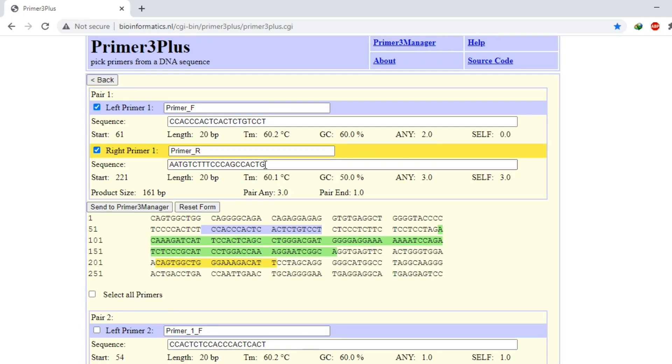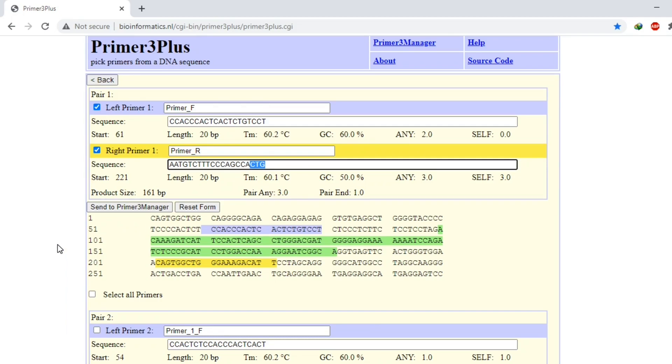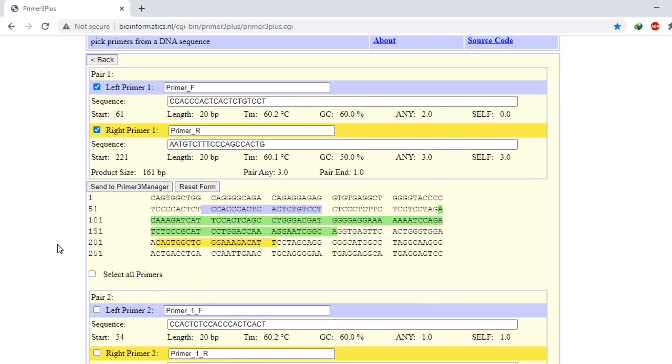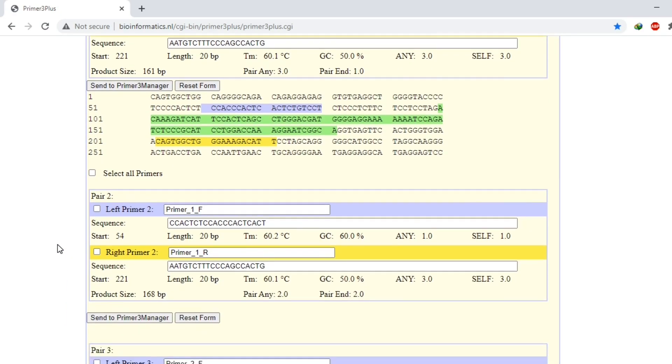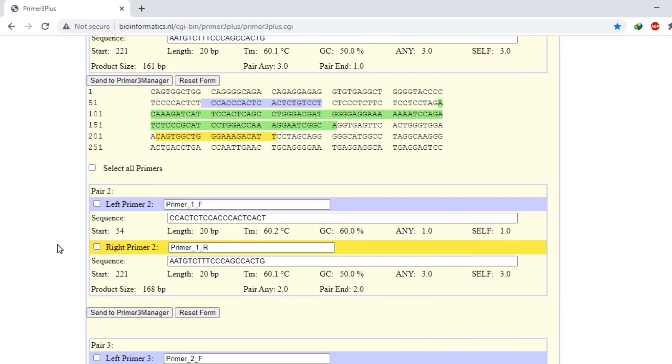But here are few other primers you can try and select any of the primers.